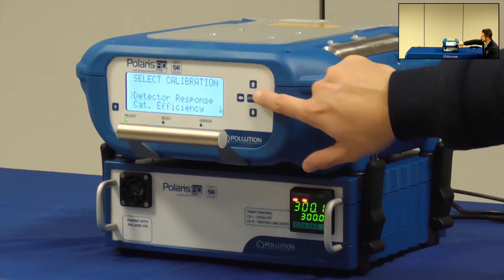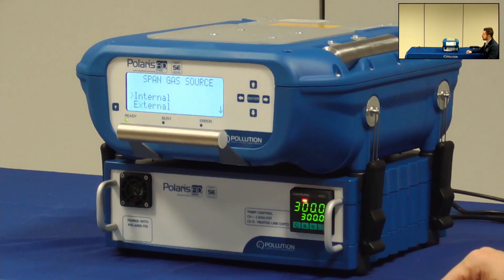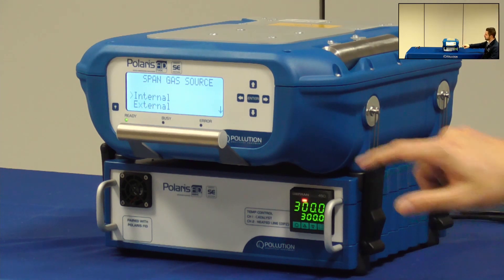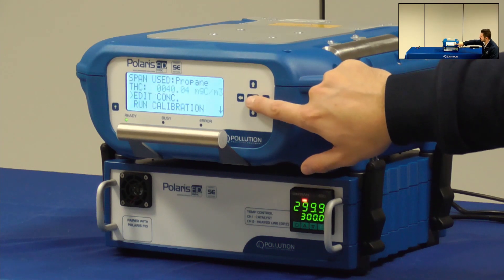I will then select detector response and decide if I want to perform an internal or external calibration by using the sampling system or the gas cylinders directly connected to the Polaris. In this case I have the integrated one-liter cylinder, so I select Internal.